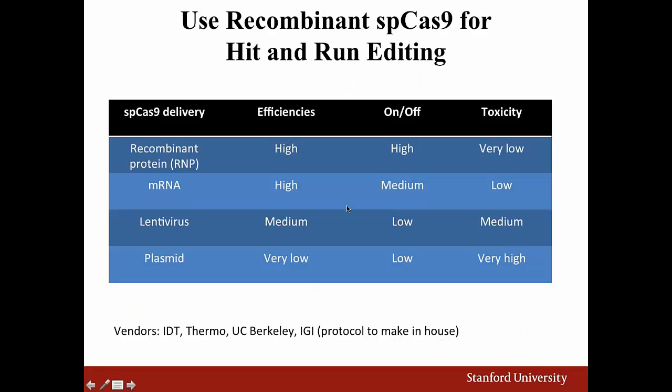And so once you have a guide RNA, of course, then you need the Cas9 nuclease, and we use the Streptococcus pyogenes, the SpCas9, within the lab. And again, I made this table about the different ways to generate or to use or deliver the Cas9 nuclease.